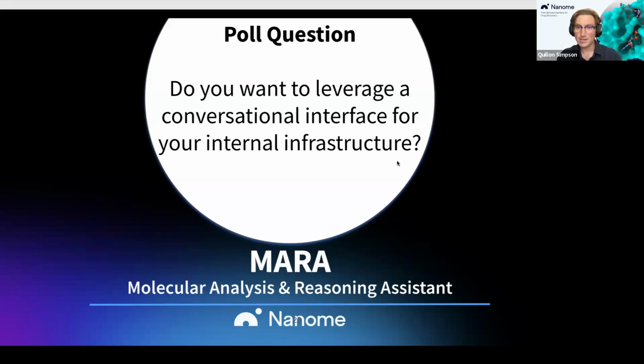I actually have a great example that could potentially be implemented based upon that workflow I showed earlier using CDD Vault. In that example, when we registered those ideas back into CDD Vault, that was a static registration. But if you were utilizing something like Signals Revvity, you'd be able to potentially save those as reaction files directly into an ELN so you can immediately schedule that for synthesis.